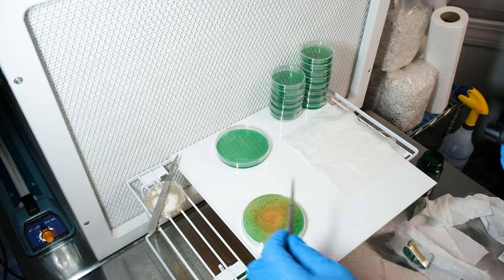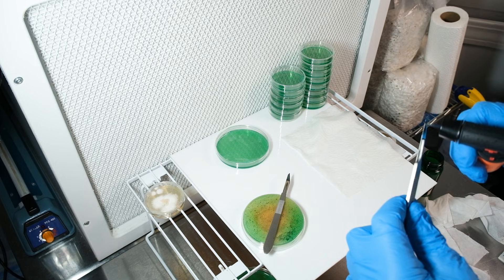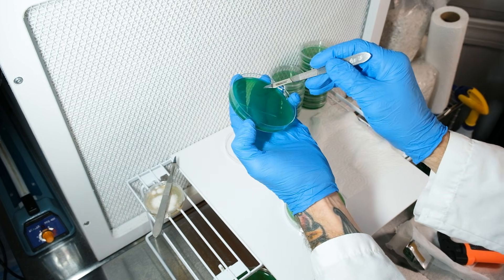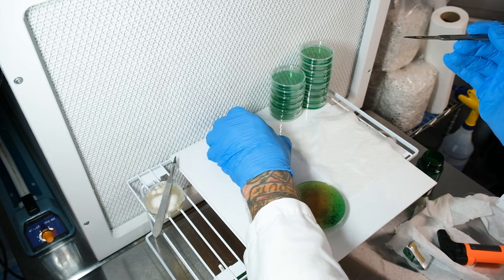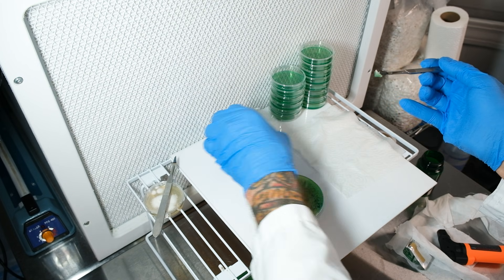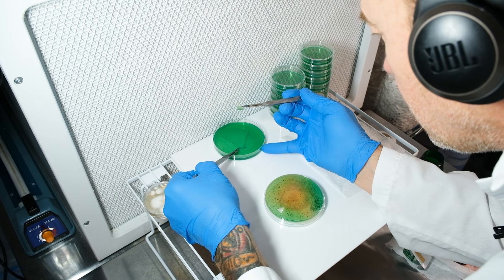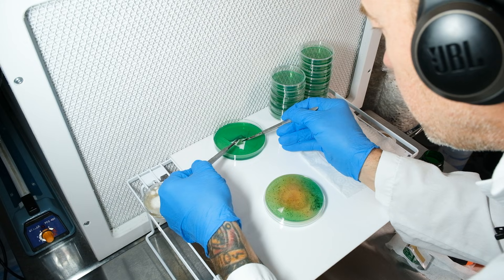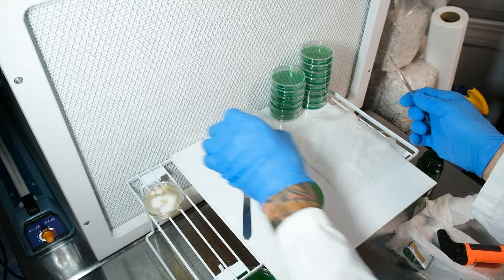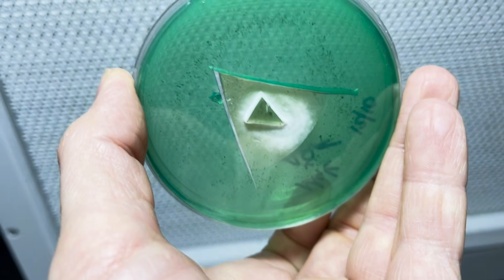You'll need two scalpels to do this. Make sure your work area is clean and ready, then flame-sterilize both scalpels. Using the first scalpel, cut a large V-shaped slice into the agar. Set that plate aside, and using that same scalpel make a small leading-edge transfer from your contaminated plate. Then grab your second clean scalpel, gently lift that flap up, place the sample underneath with the mycelium facing upward, and sandwich it between the agar. The mycelium will grow straight through, and you can grab a clean sample to transfer to another plate.